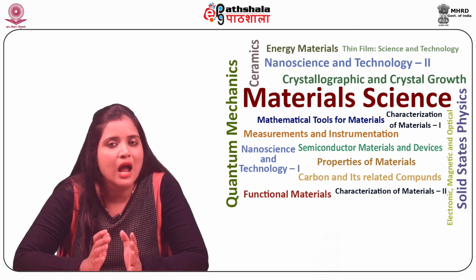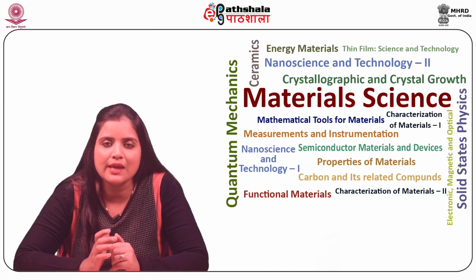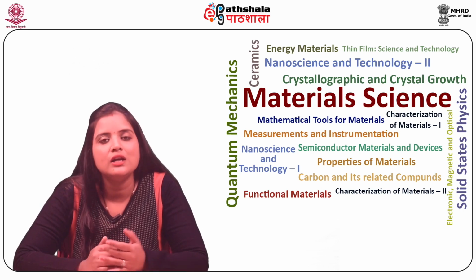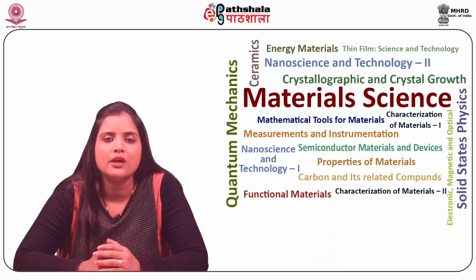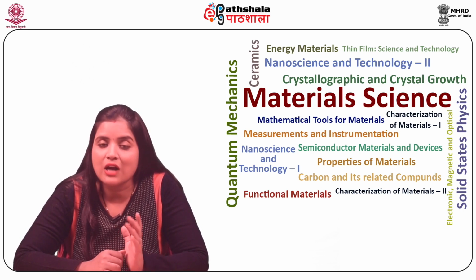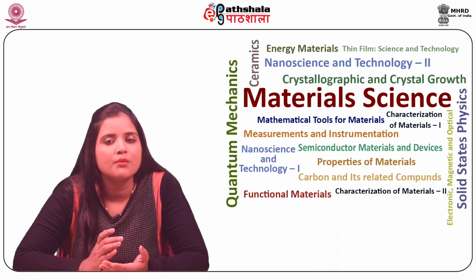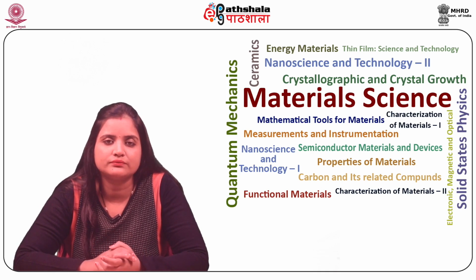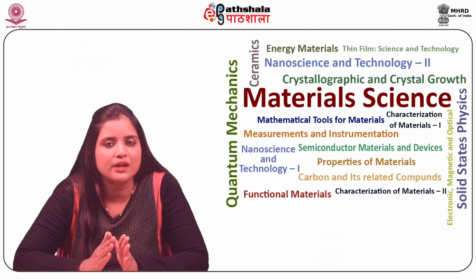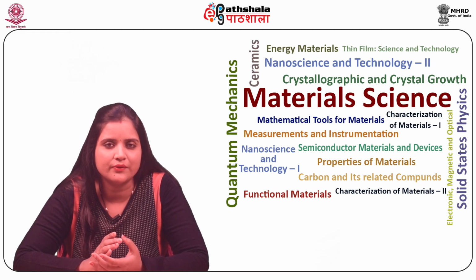However, the cracks or perforations that might be present in the lens cement draw oil by capillary action, leading to a thin film of oil sneaking to the back of the objective. This gradually deteriorates the image quality, which might not be spotted immediately. This problem is very difficult to comprehend as it affects the microscope performance gradually.